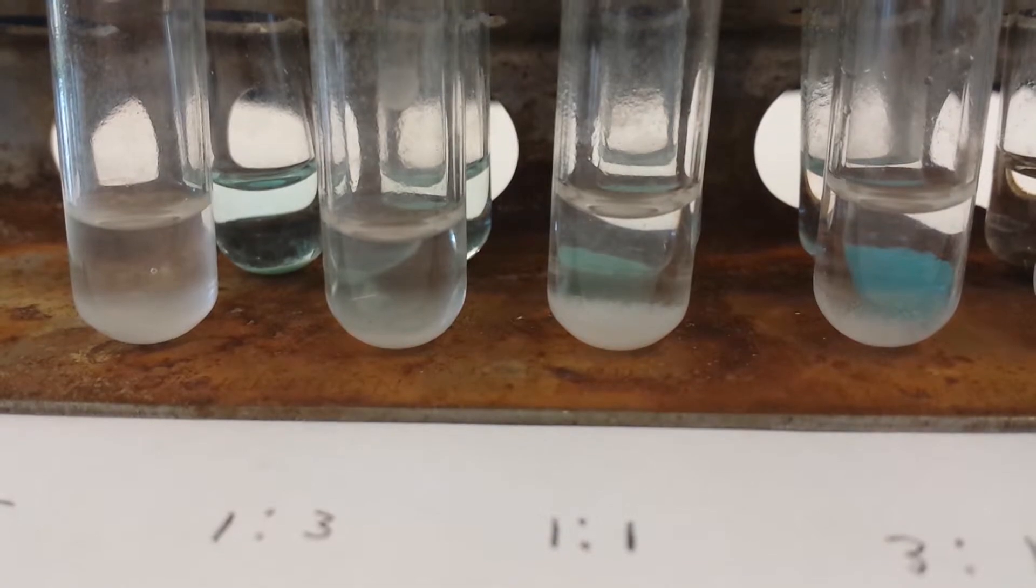Waiting for it to focus there. There we go. So it is clearly the biggest precipitate.